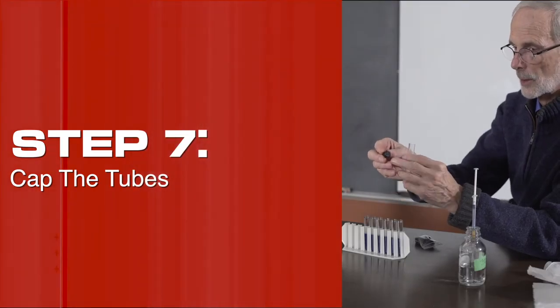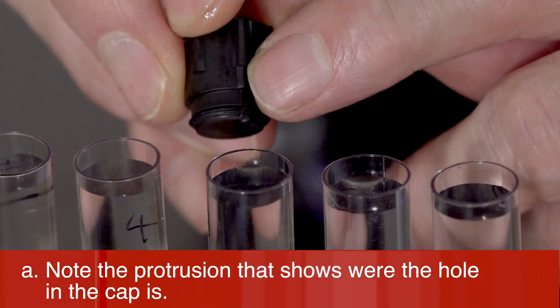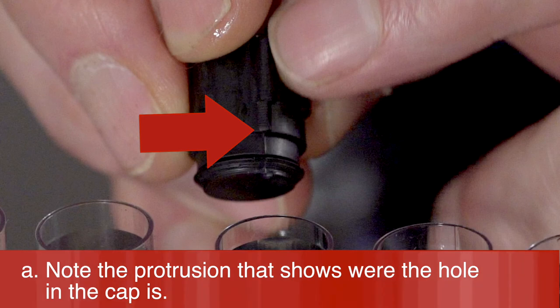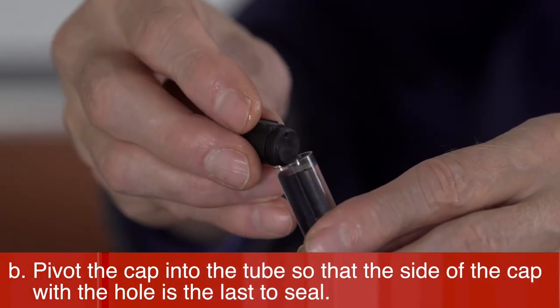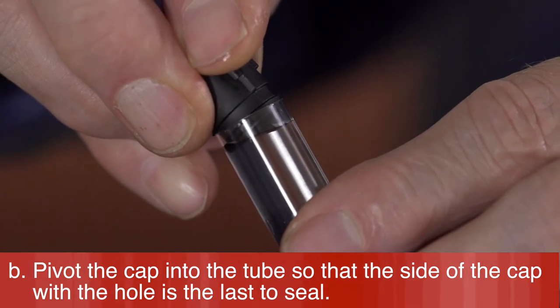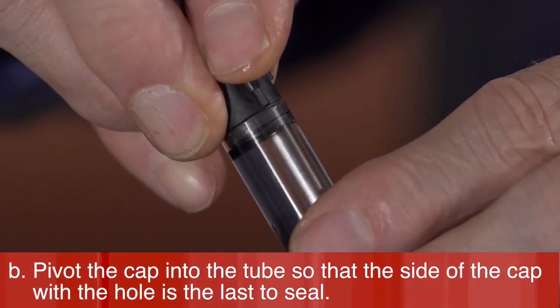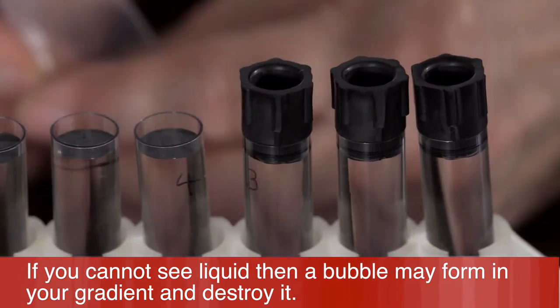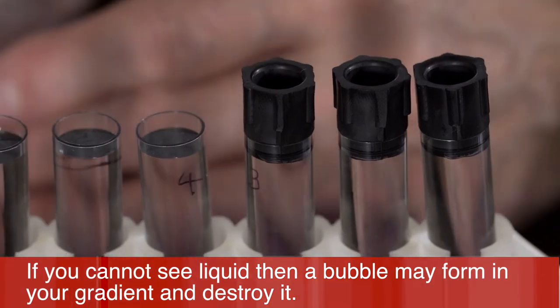Step 7: Cap the tubes. Note the protrusion that shows where the hole in the cap is. Pivot the cap into the tube so that the side of the cap with the hole is the last to seal. Some liquid should be visible inside the cap — if you cannot see liquid, a bubble may form in your gradient and destroy it.